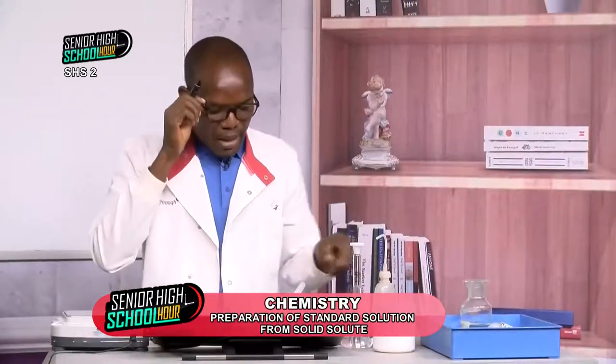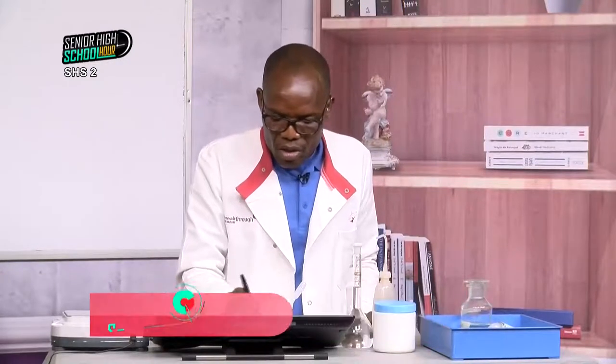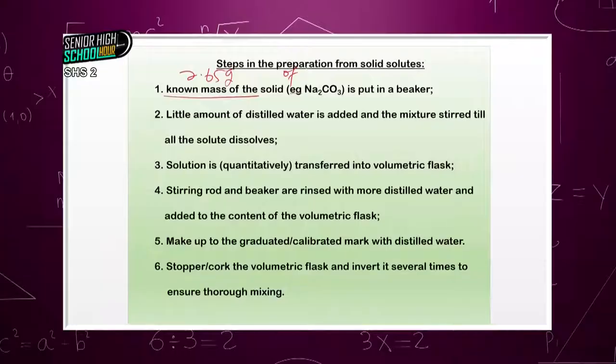So since I know my mass, my mass here will be 2.65 grams of sodium carbonate put in a beaker, then a little distilled water added, and so on. What is the capacity of the volumetric flask? Three, the solution is transferred quantitatively, meaning you are not losing anything, into a 250 cm cubed volumetric flask, and then you continue from there. Is that okay? Yes. Okay, so that's it.